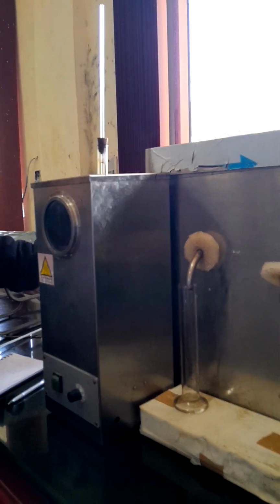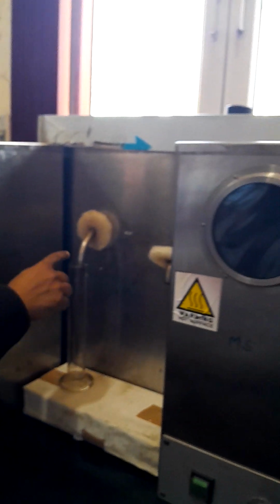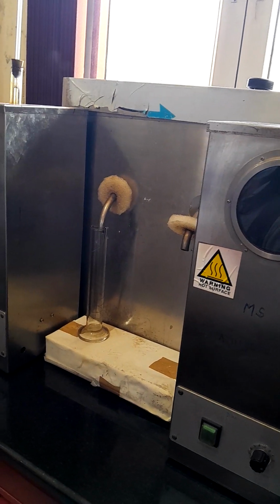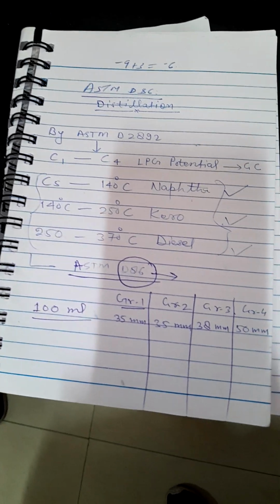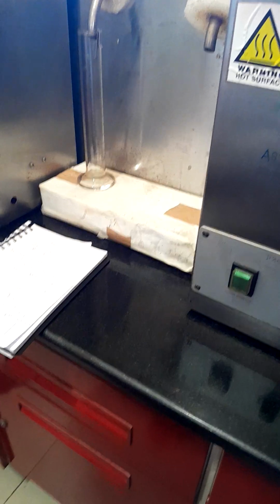If you are not heating the condenser after 270, this capillary will be choked from the inside. Your sample is passing through but not reaching the condenser, because otherwise your condenser will be at 0 to 4 degrees centigrade.